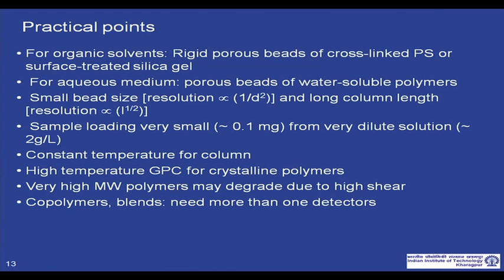Okay, before that let us go through a few practical points. For example, for organic solvents the beads typically used are cross linked polystyrene or surface treated silica gel, and for aqueous medium porous beads of cross linked water soluble polymers are used.